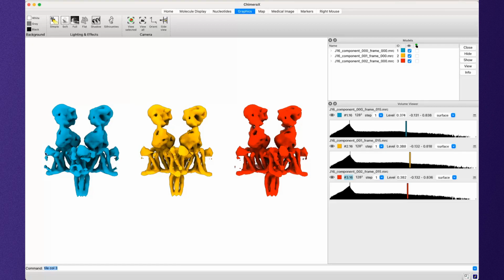And the way this ion channel works is we've got the terminal domain here, and then we have the main ion channel, which is in a micelle that you can't see right now because of the contour I've set. And then these are two fabs. Those are fragments of an antibody that bind the antigen. So this is just to sort of help orient and align the particle. These are not part of the channel, but we still would like to be able to resolve them, and they provide a good illustration of this technique.